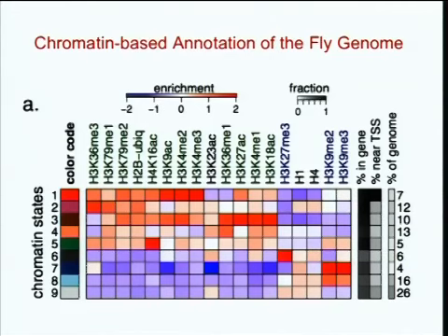So I just zoomed into that upper left panel. Okay, so different chromatin states correspond to different enrichment of different factors. Obviously, trying to figure out how many states there are is like trying to figure out how many clusters there are in a dendrogram. And we try to correlate. In fact, we have a huge panel of how each of these features are related to other genomic features.